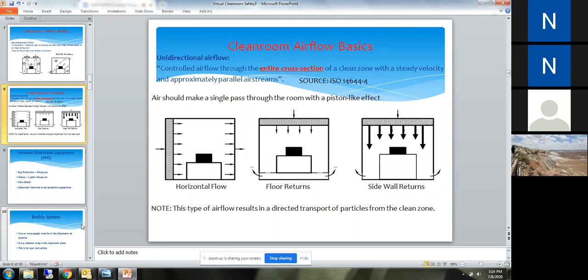And for the middle picture, this is our clean room. So you have the HEPA filters up in the ceiling. If the students were here, they would be going to the clean room, and I'd be telling them, if you look up in the ceiling, you will see light fixtures interspaced with HEPA filters. And the air is unidirectional. It moves from those HEPA filters through the perforated floors right here. And then the subfloor is like a giant duct or giant return. That's how the air moves back up through the filters and back into the HEPA filters.